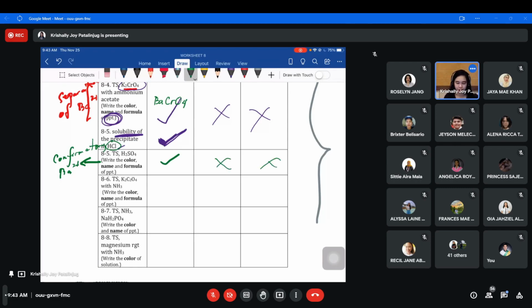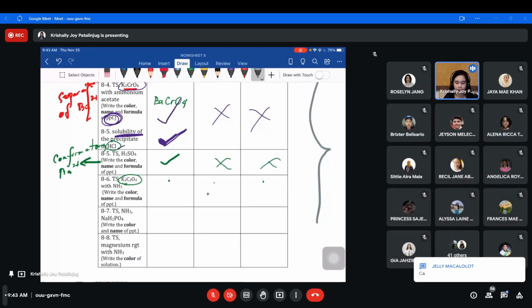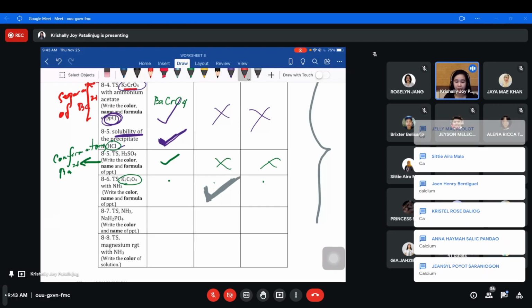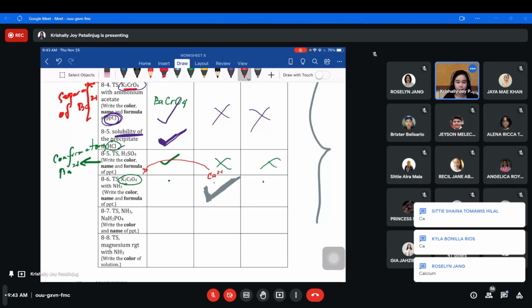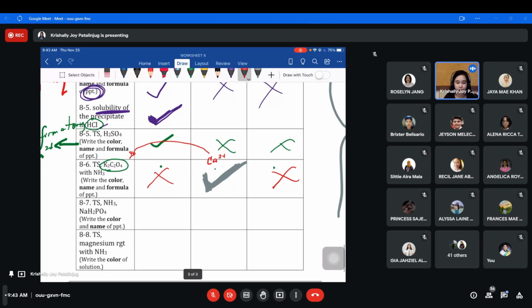Wala ni siya. Nakuha? Then for oxalate, ano yung ion that is being confirmed with potassium oxalate between barium, calcium, and magnesium? Okay, very good. It's the calcium. No? Kanara ang naay answer. Kaninga part dire. Kasi barium is the one, calcium. No? It's the calcium ion that is being reacted with potassium oxalate. Ayan. Kito, walang sagot dapat dito. Okay, so careful mo when you fill in your answer.